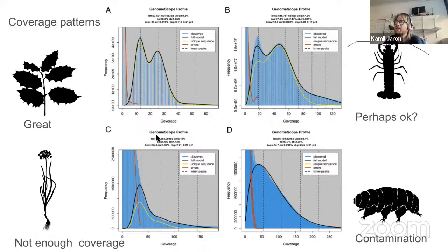And if you would actually put that in, you remember that equation for estimating the genome size. Basically, what you can do is take the coverage that was estimated, multiply by that, and then divide it by the real coverage, and get what would be the genome size, right? And you will see that if you cannot estimate the coverage right, you cannot have the genome size right. So when you have a completely nonsensical genome size estimate and it looks like a hockey stick, you know that you probably don't have coverage.